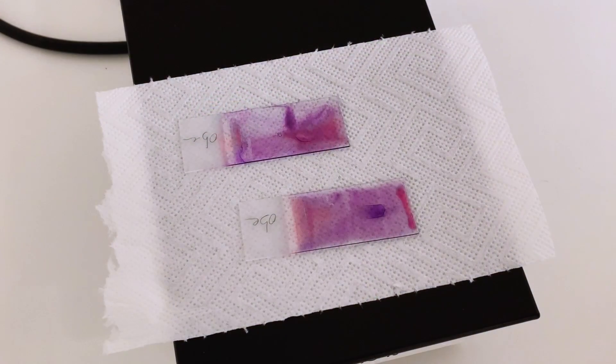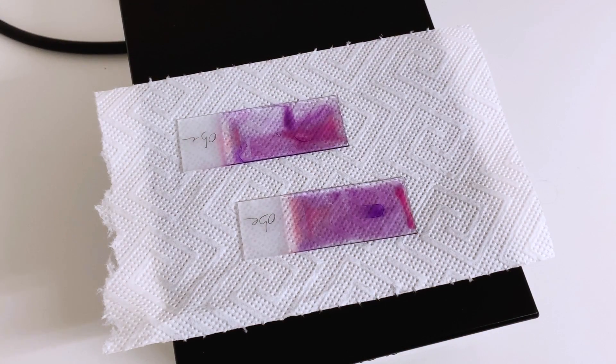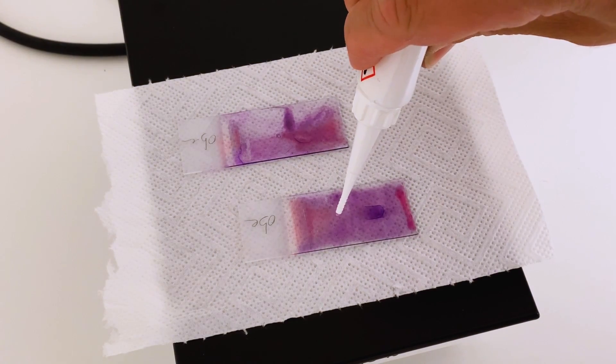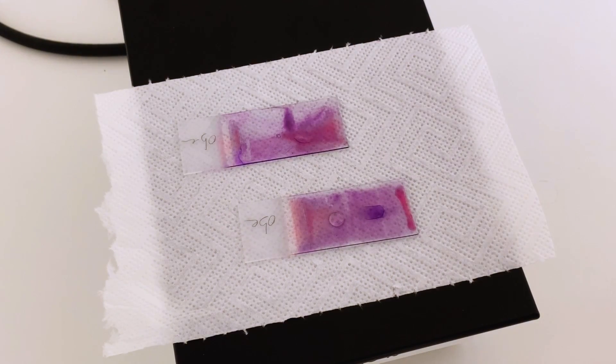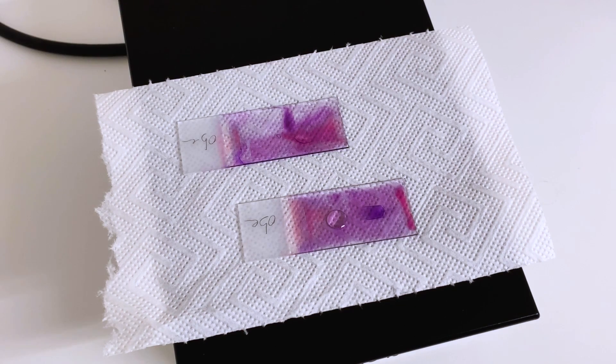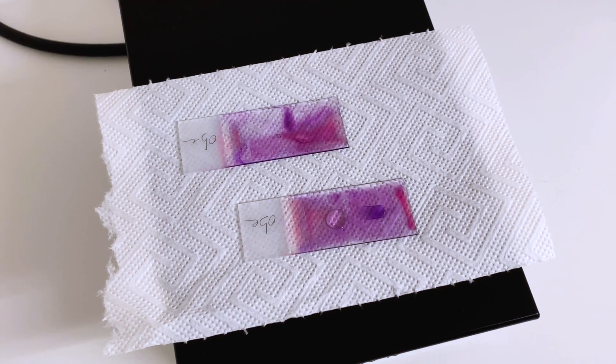Let's go back to our seminal smears. Now it's time for sperm morphology. I'm using oil because the magnification is a thousand times and without oil I wouldn't be able to see much. The criteria for assessing sperm morphology are very strict. One has to be very picky and very careful just to choose the perfectly normal sperm cells. And it's no wonder that the threshold for normal is four percent.